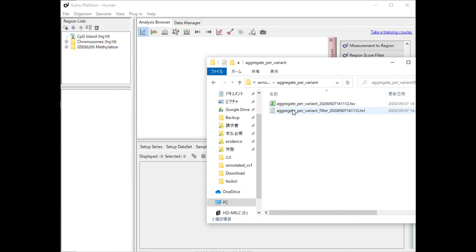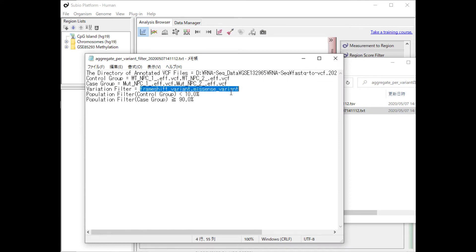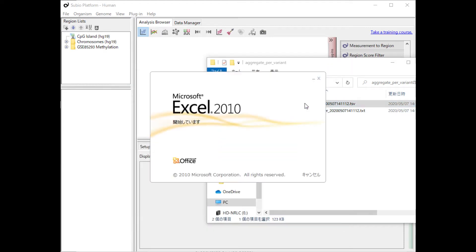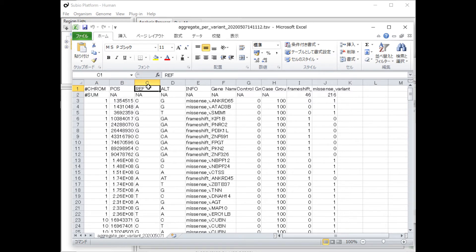There is Aggregate Per Variant Folder in the folder containing the input VCF files, and the results are stored in it. The .txt file notes the settings for the filter. On the other hand, the .tsv file is the aggregate result.